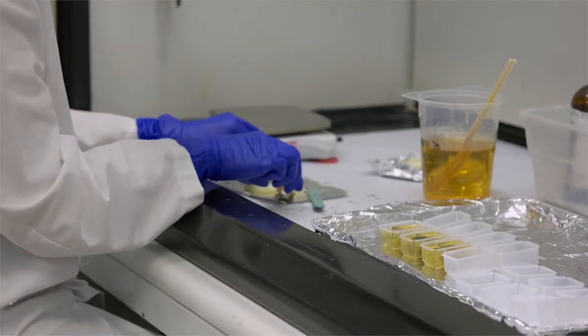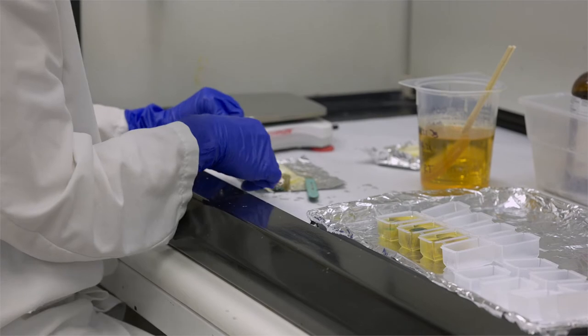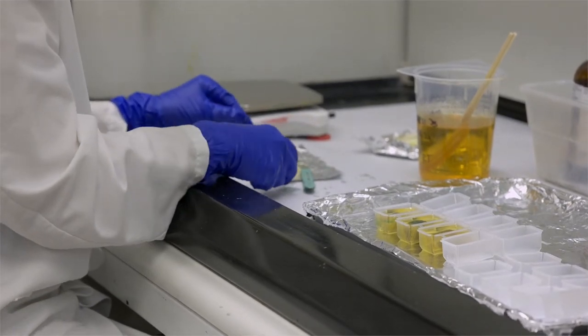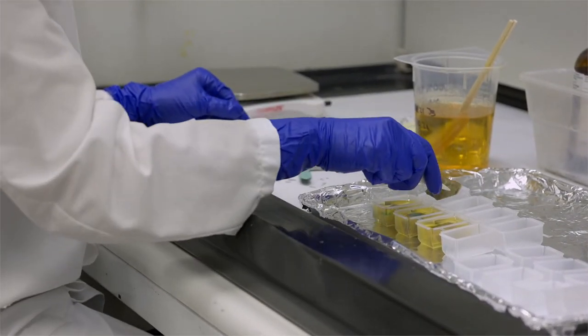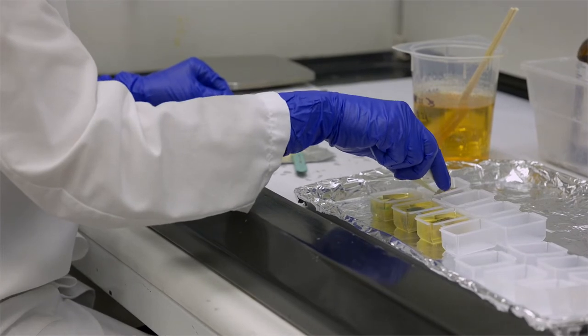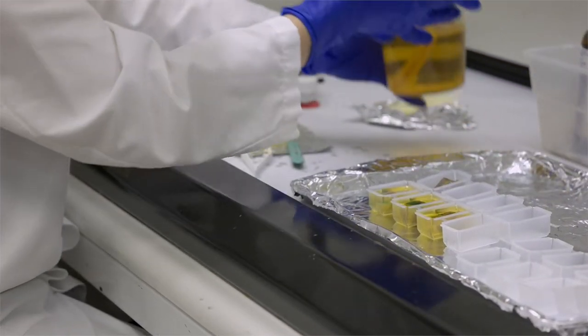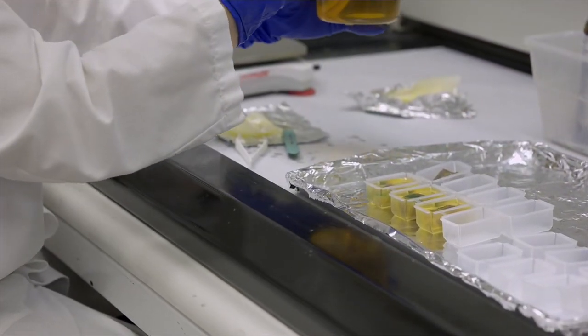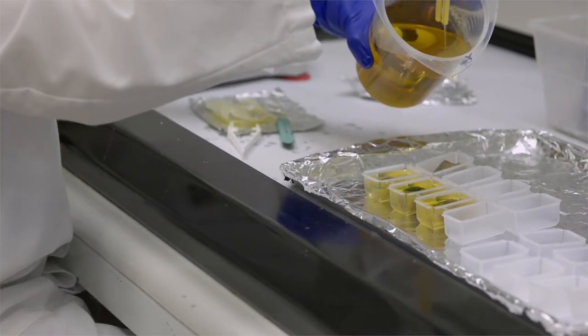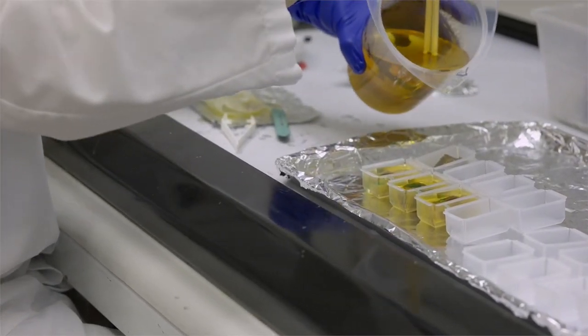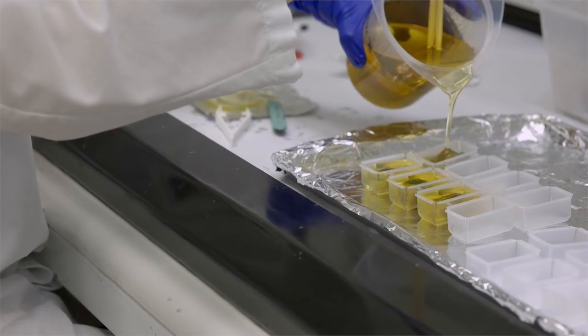Once infiltration of the spur resin is complete, an appropriate size mold is chosen to embed the sample. The sample is arranged in the mold with 100% spur epoxy resin. Trapped air is removed and the mold is placed in a 60 degree centigrade oven for 24 to 72 hours to harden.